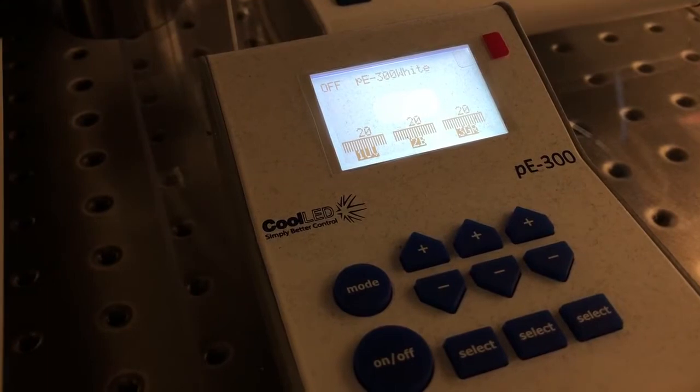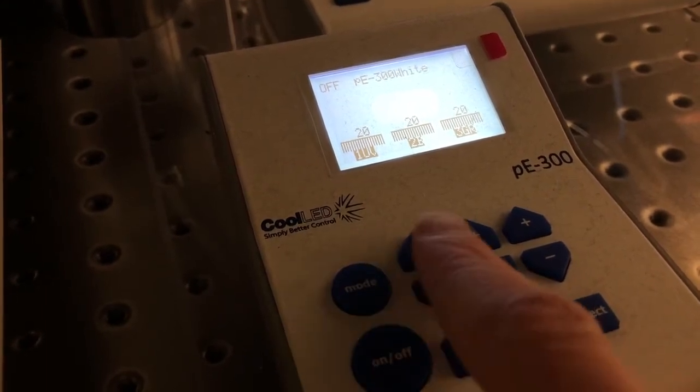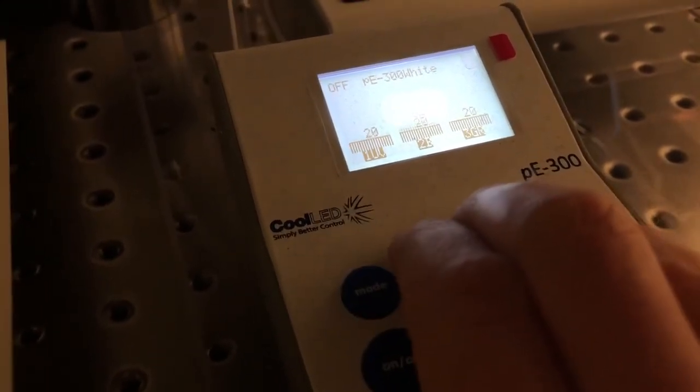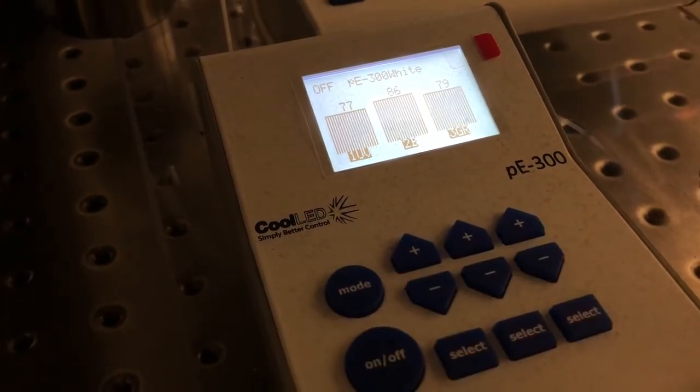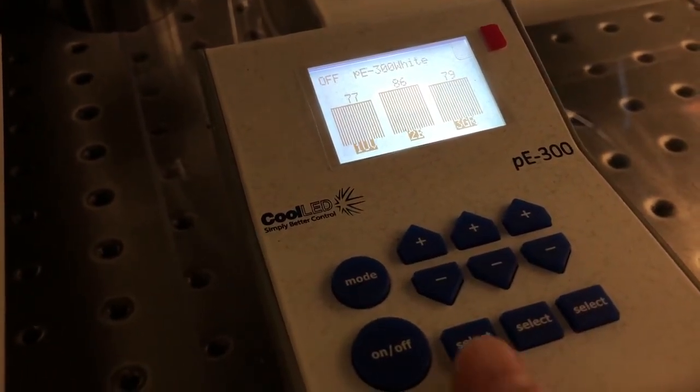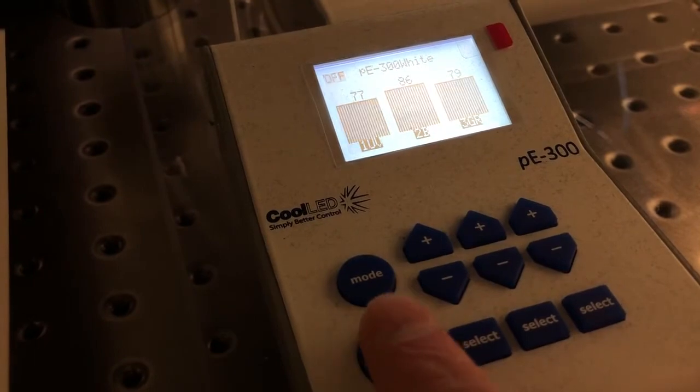If you need to increase the intensity of illumination, you can push these three buttons up to get brighter light when you turn on the illumination by pressing this button.